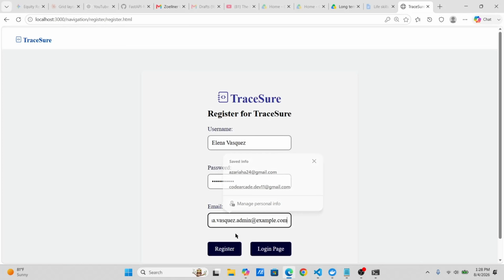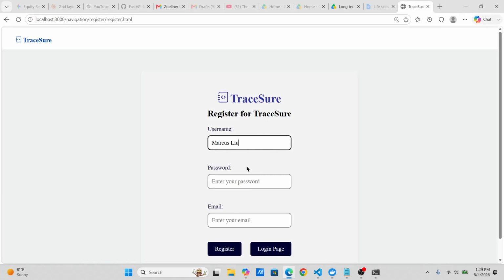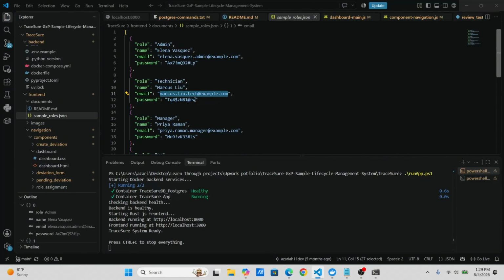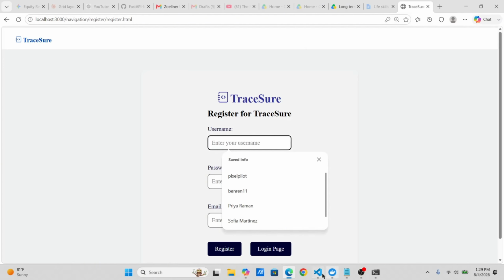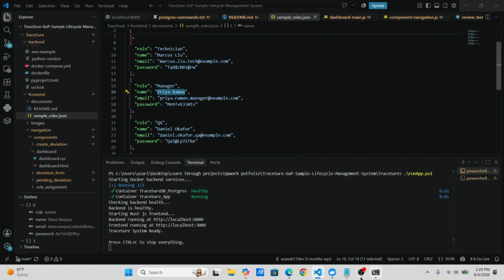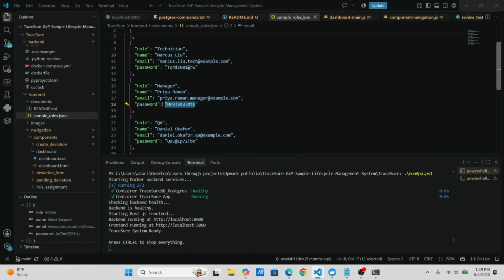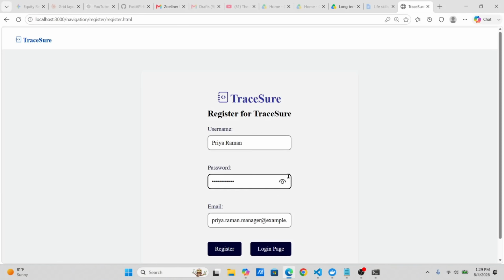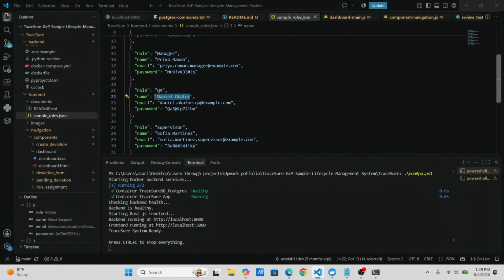Take a second to finish this up. Register. Let's register more accounts here.